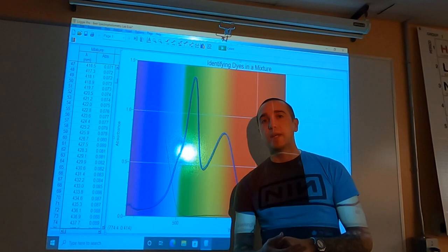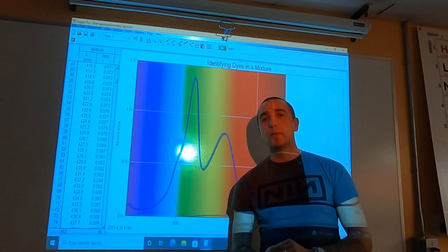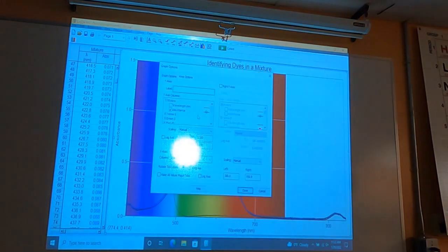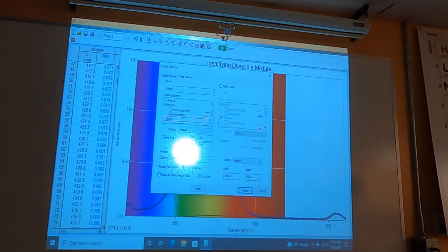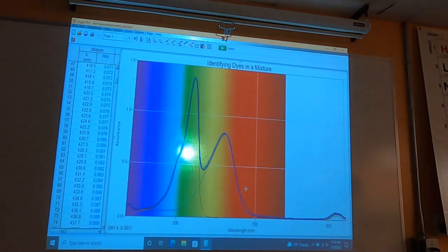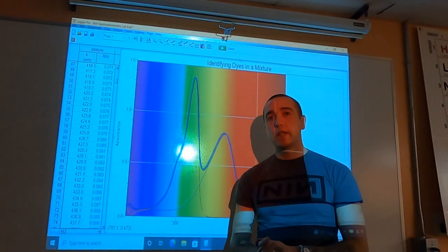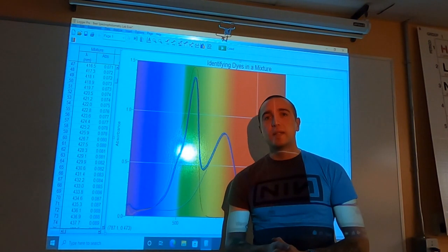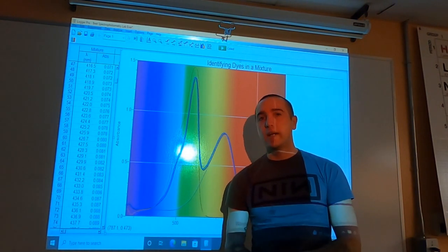So what I'm going to do now is leave the mixture up, but then put the two that I think it is in the mixture up side by side to show that they add together to create this mixture curve. So here we have it, very clear proof that the overall mixture that I tested is a combination of red 3 and blue 2.